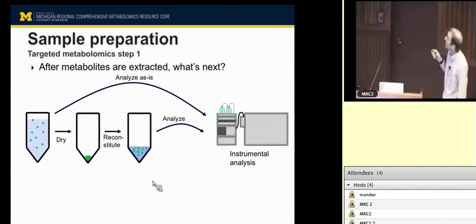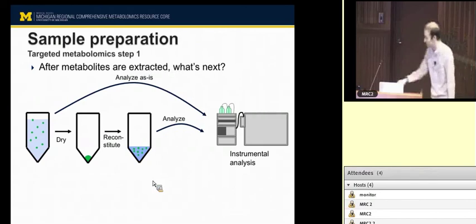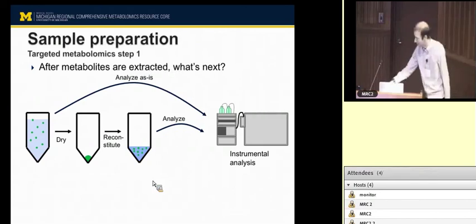Okay, instrumental analysis, the second step, we're only on step 2, is to use it to detect and analyze these metabolites in your sample. Is it a black box? No, it's not. We'll try to open up that black box later this afternoon. Okay, not a black box.